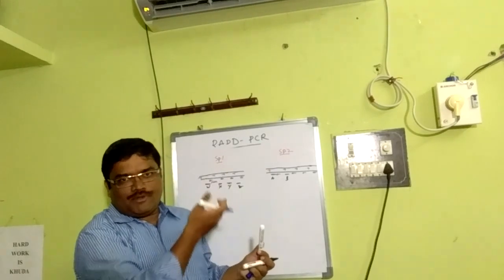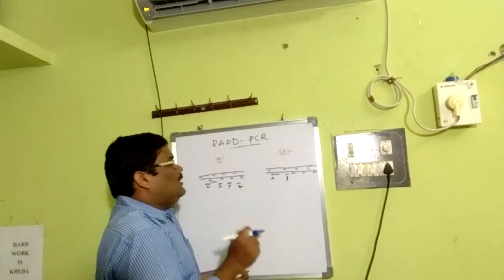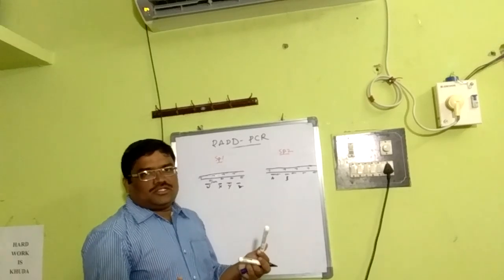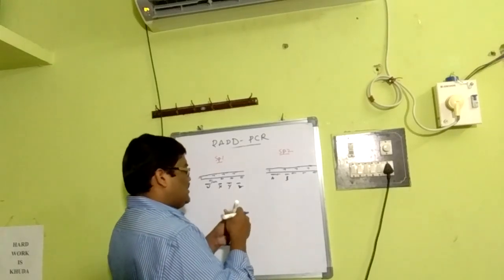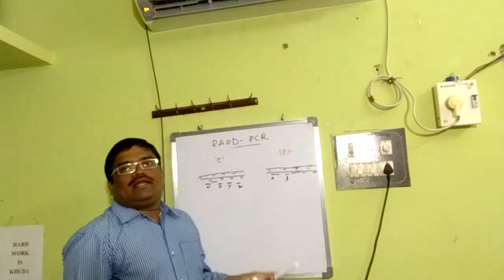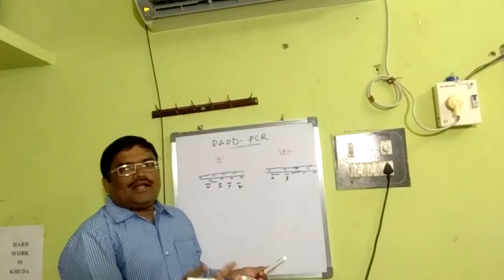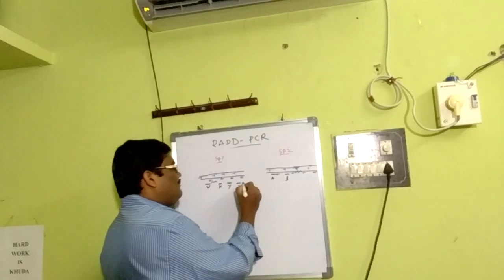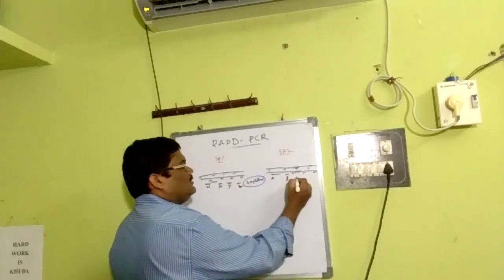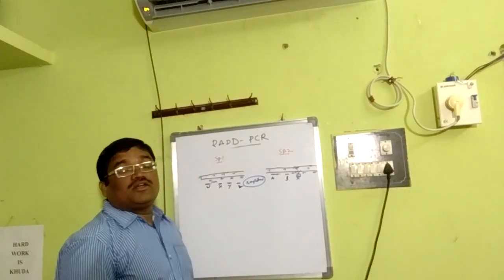With respect to the basic PCR technique, denaturation and all that, I'm not going to the basics of PCR. But here, what happens? A mutation occurs. I told you SNPs are because of mutations. Say a mutation happens and that leads to, see, here there is no primer annealing. No primer annealing means no amplification. Here these are all amplified products. But here no. That means the C segment has no amplification because of mutation.